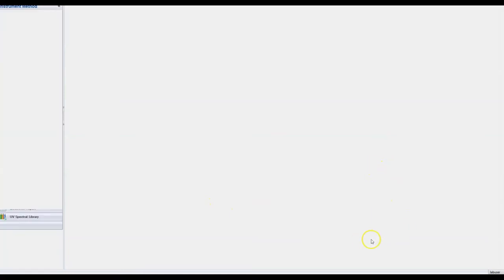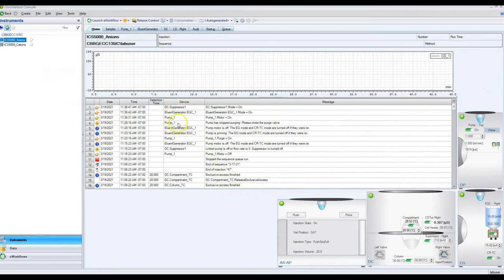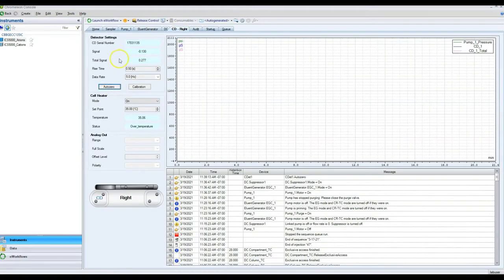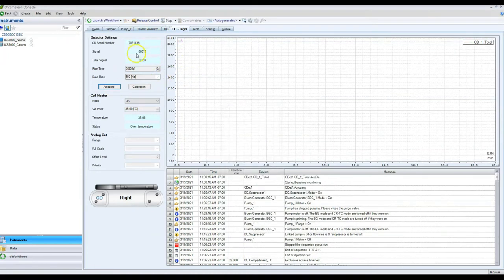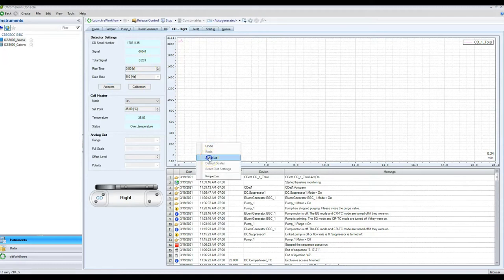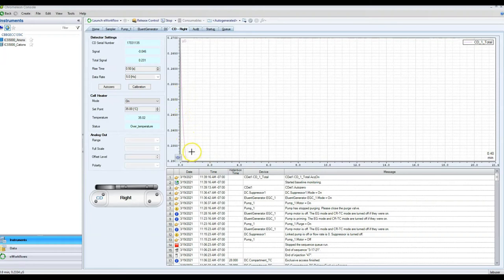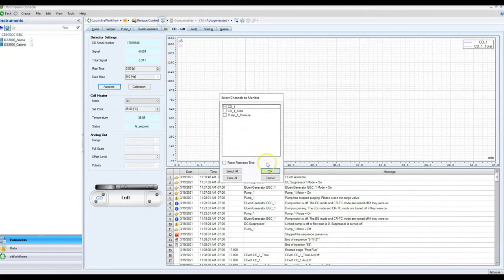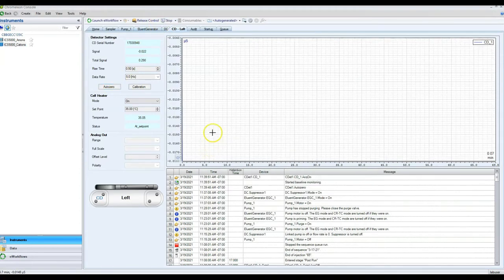Now we've set the instrument to the correct settings and need to let it equilibrate — we want a really flat baseline before we start the run. Go to the conductivity detector, hit Auto Zero, then Monitor Baseline. This starts measuring the signal, and we're good to start when the signal has stopped changing. You want the total signal to be as low as possible — anything less than 1 is a healthy column, less than 0.5 is pretty good, and 0.2–0.3 is great. Do this for both the anion and cation sides. It takes anywhere from 5 to 30 minutes.